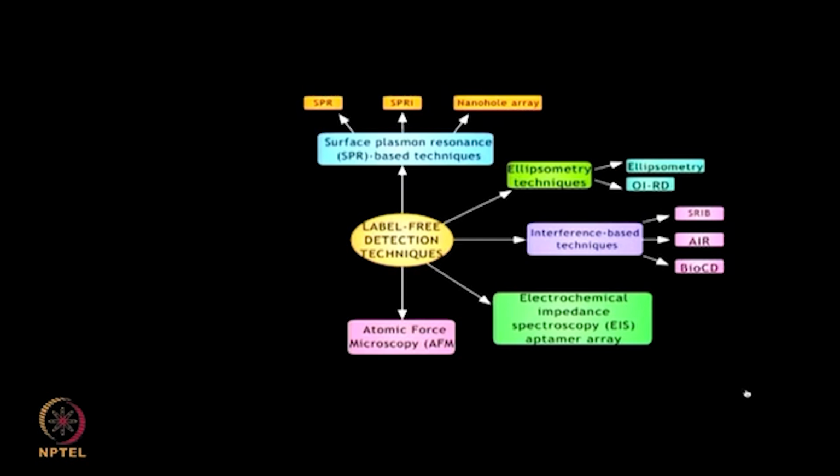Atomic force microscopy, AFM: the vertical or horizontal deflections of a cantilever are measured by a high resolution scanning probe microscope, thereby providing significant information about surface features.